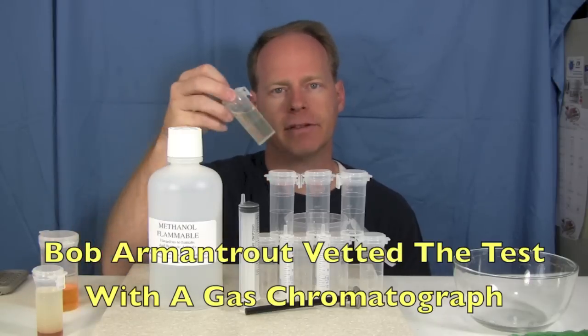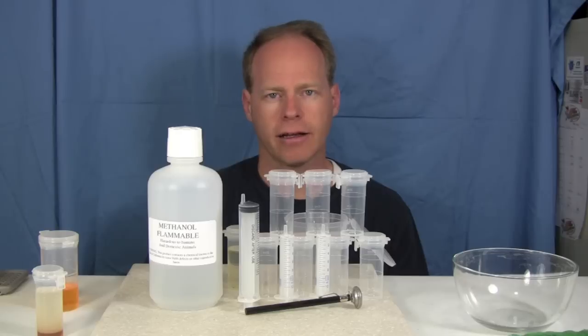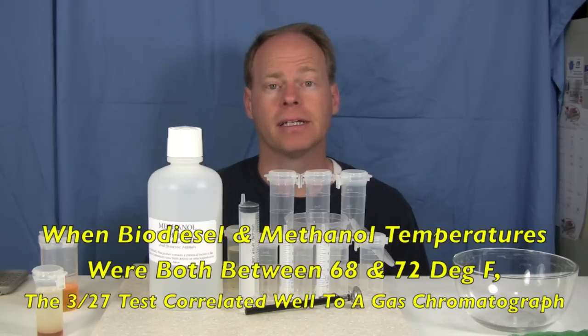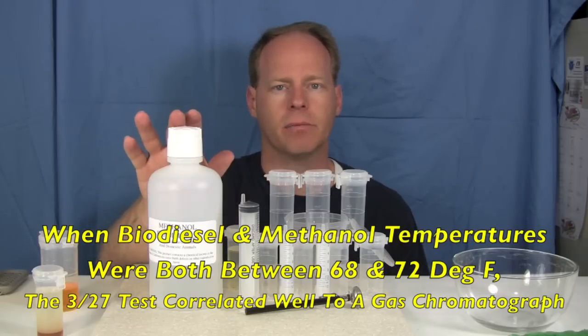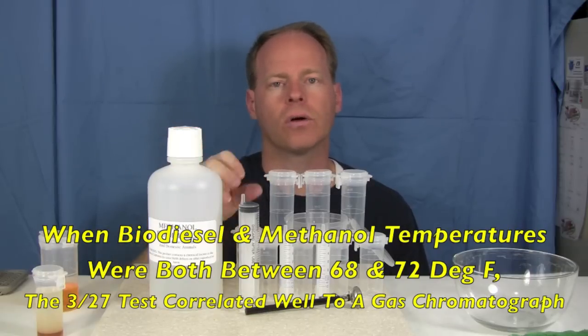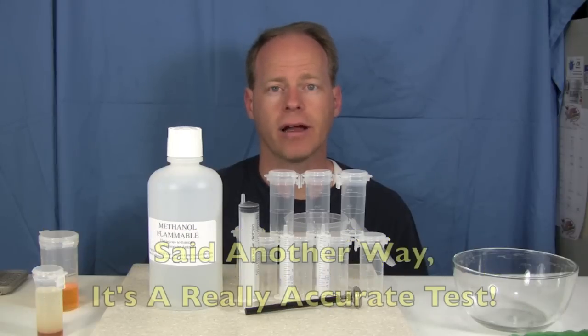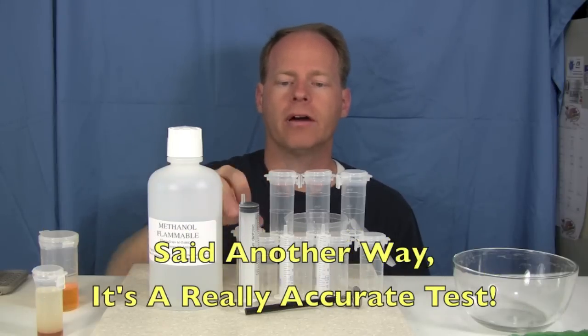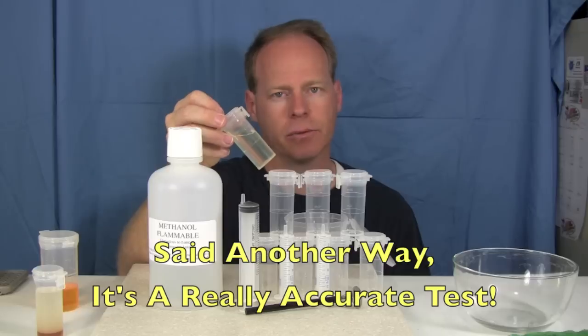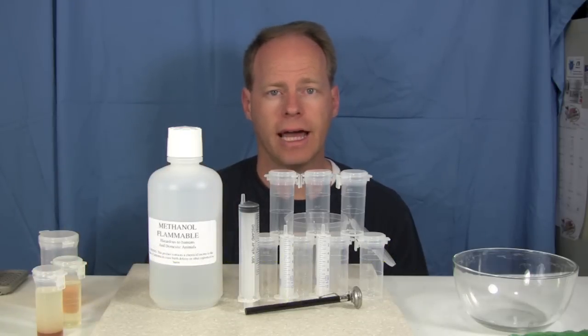He performed a 3-2-7 test on all of the fuel, and then he performed a gas chromatograph test on it. What he found is that if the temperature of the biodiesel was between 68 and 72 degrees Fahrenheit, as well as the methanol, then the results of this test passing or failing highly correlated with the results on a gas chromatograph. So thereby we have a very accurate but simple test that is fairly accurate to what you would get if you were to send it off to a lab.